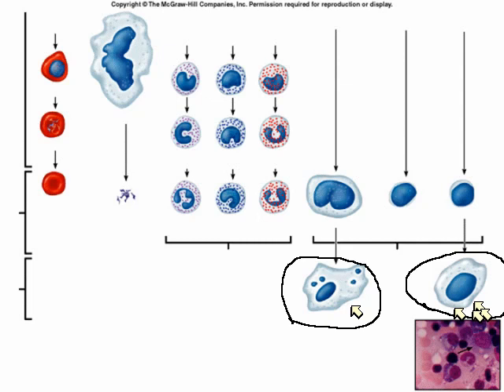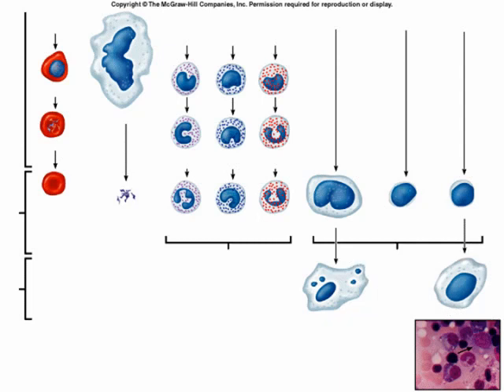That's a cell that's actively secreting antibodies. It comes from the lymphocytes. It's called a plasma cell. All right, don't worry about macrophages or plasma cells for your lab for exercise 37. We're just going to look at the various blood cells under the microscope.